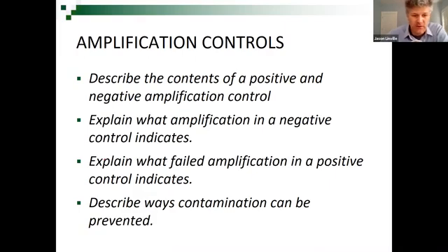And this is one of those things, just to forewarn you, that I'll put in a question on a quiz: you run an amplification reaction and your negative control is positive. What does that mean? And the student's sitting there going, well, it either means something's not working or there's contamination, and you just take a guess.